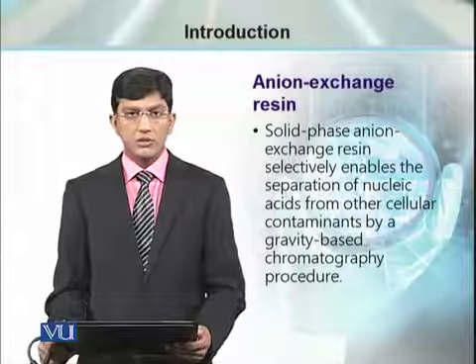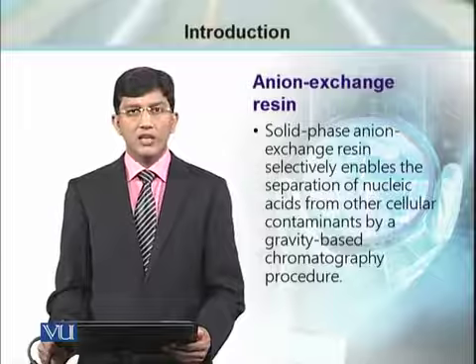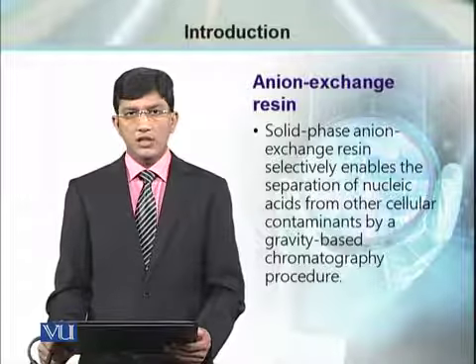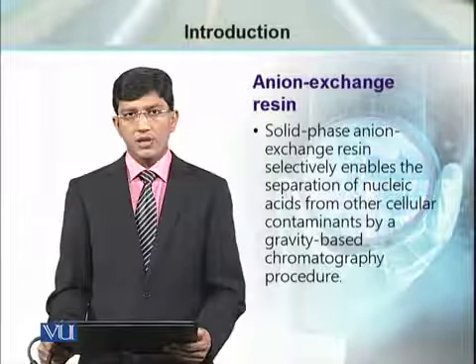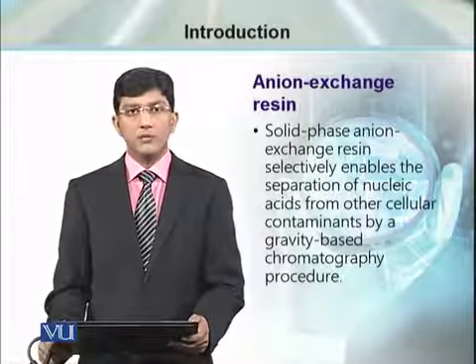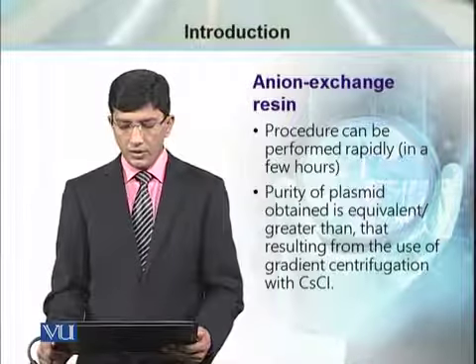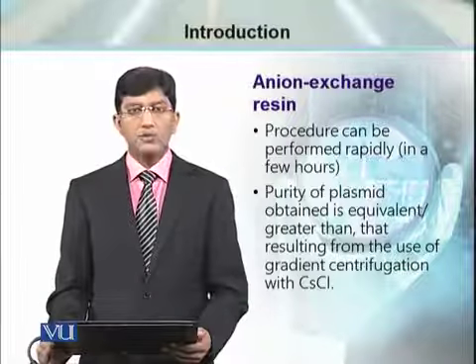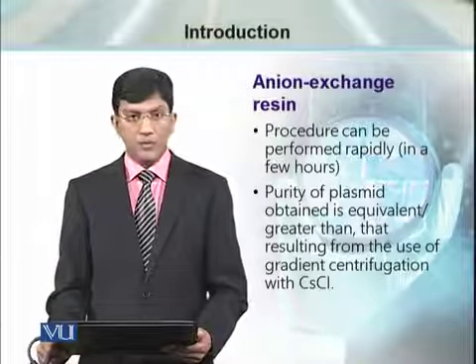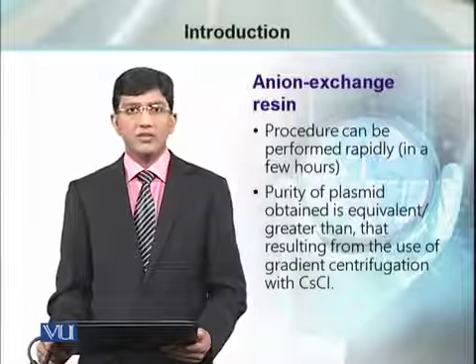One example of such columns is anion-exchange resin. As we know, DNA is a negatively charged molecule, so it has close affinity with positively charged particles. So these columns carry positively charged particles to which negatively charged DNA can bind, and later on it can be eluted or purified using a gravity-based chromatography procedure. This procedure can be performed relatively quickly as compared to the cesium chloride method. As far as purity of the plasmid is concerned, this gives purified plasmid equivalent or greater than the cesium chloride method.